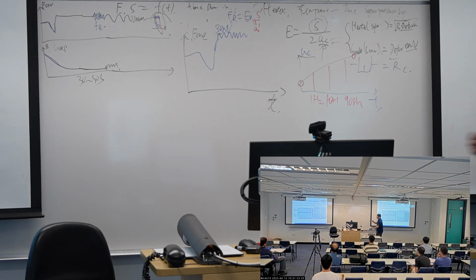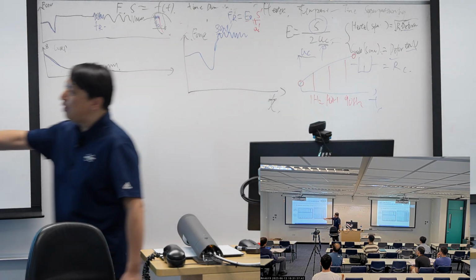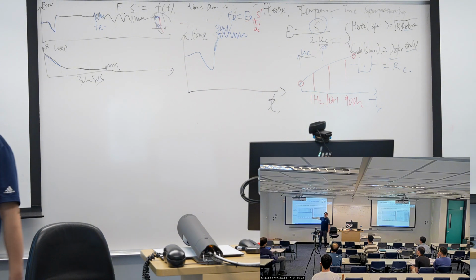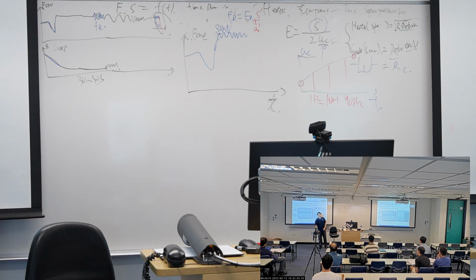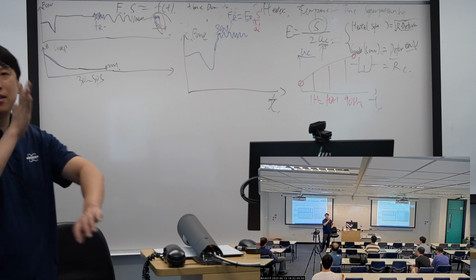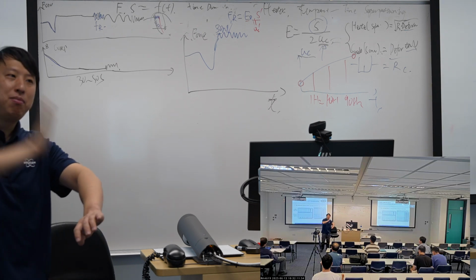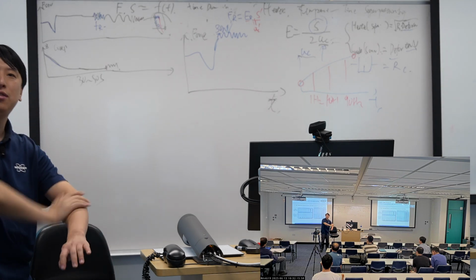And so today we are doing the frequency domain. So as the frequency increases, the modulus will increase. That's your life feeling. If you punch something quite fast, you can sense it's hard. If you touch it gently or slowly, you sense it's soft.